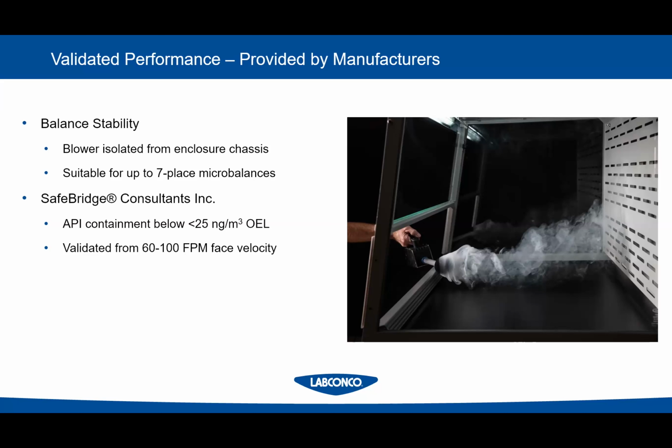As you can imagine, weighing is some people are really good at it and some people are really messy at it. You know, think about a cook in a kitchen. Some people use every pan, some people only use one. So if you don't have good technique at weighing, you can cause a lot more powder to come out of that enclosure than someone that does. So that's kind of a variance that plays in as well.